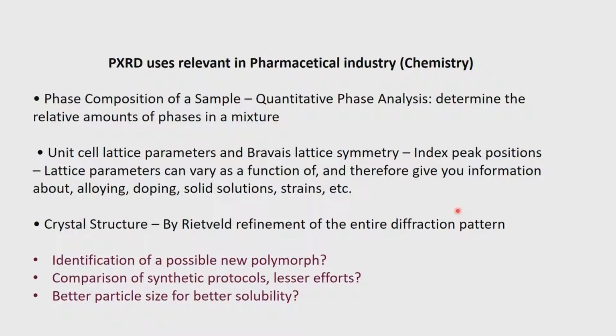It is not necessary that we index only some 10 or 12 reflections. We have to, in fact, in principle index the entire diffraction pattern. Some of the peaks may be weak, some of them may be strong, and we have to identify all possible peaks which appear once we have the crystal system which has been analyzed.